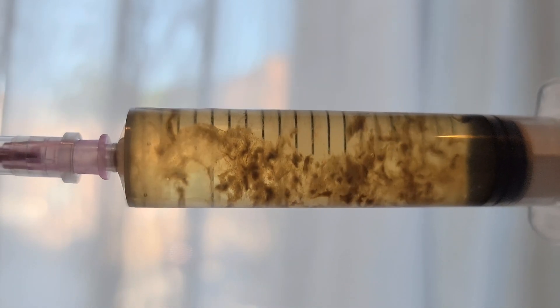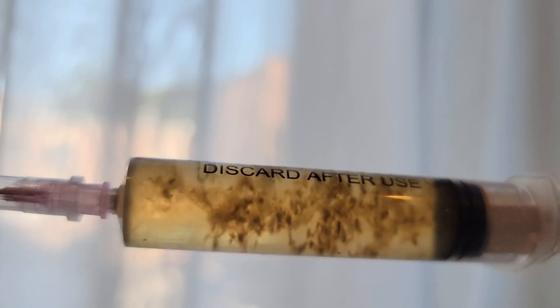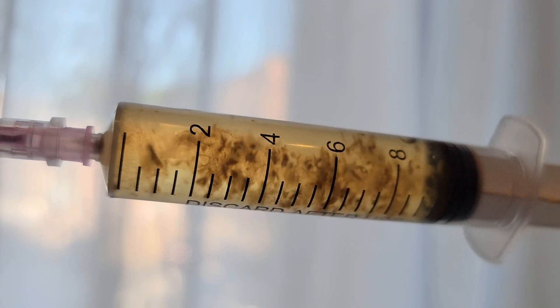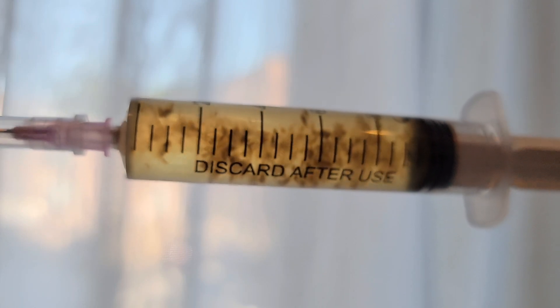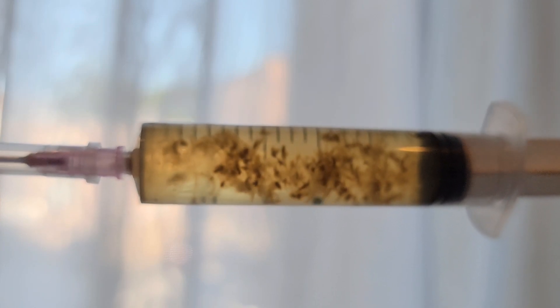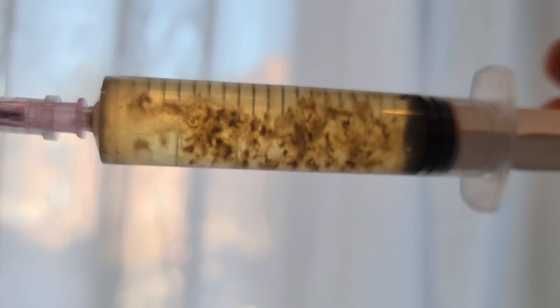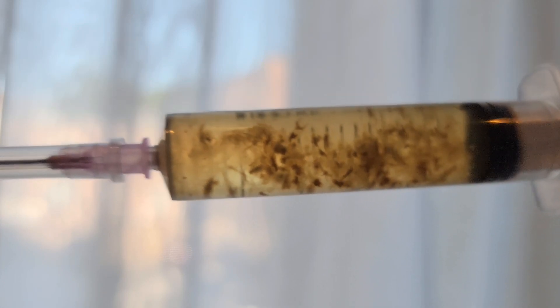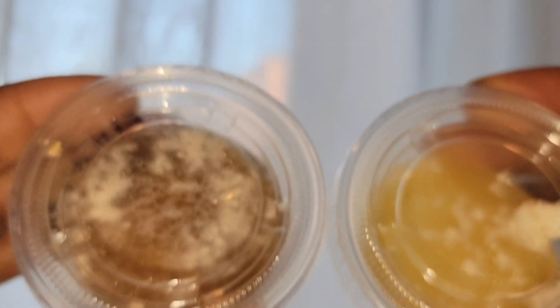We're going to look at how to do that, starting with step one: the culture. This is Hericium erinaceus on a liquid culture. The liquid is only water and honey. The mixture I use is 1.5 cups of water to a tablespoon of honey. The mycelium will last on this for well over a year, but it's suggested not to keep it on liquid culture too long — I would suggest either slanting it up or putting it on agar.